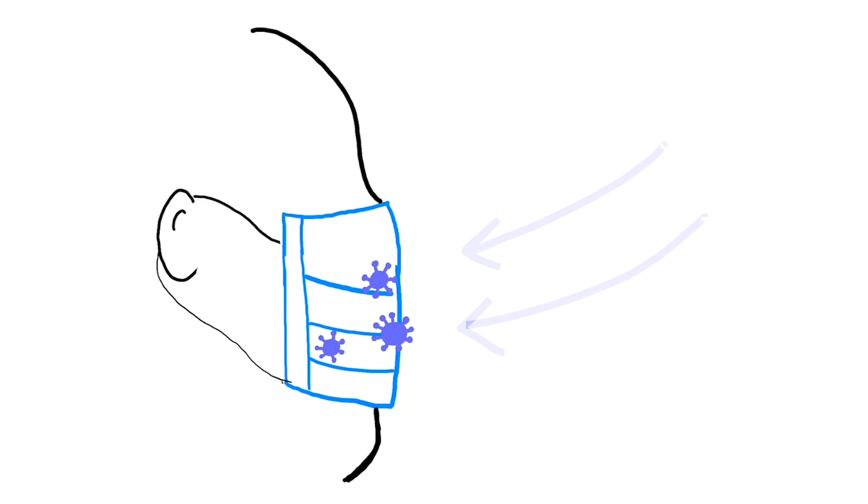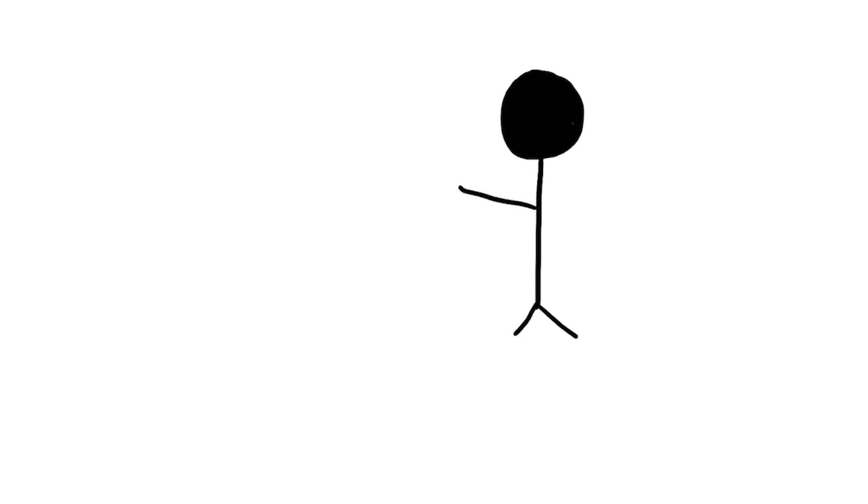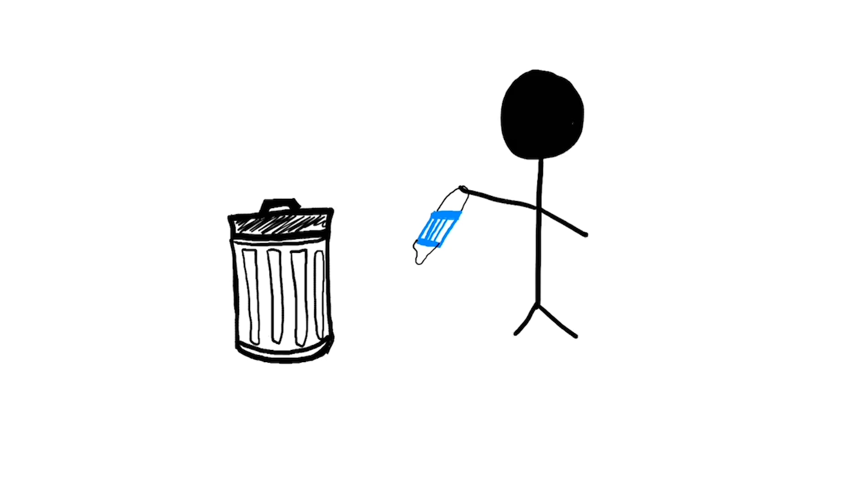Laboratory surgical masks should be disposed of at the end of the day, or if damaged or contaminated. When removing your mask, only touch the loops that go around your ear.